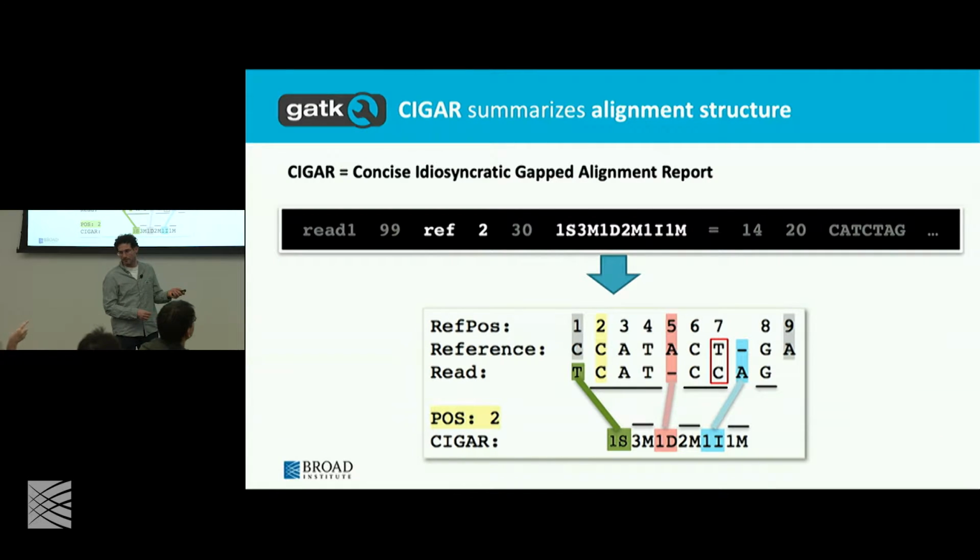But why did you decide to push that as a gap as opposed to just pushing over the CCAG line? Because then you would get a lot of mismatches, right? So the job of the aligner is exactly to try to minimize the mismatches. Okay. So it's looking first to find the best alignment, and then after it does that, it assigns the CIGAR. Correct. So there are aligners, I don't remember which one, maybe Minimap. Anyway, there are aligners.